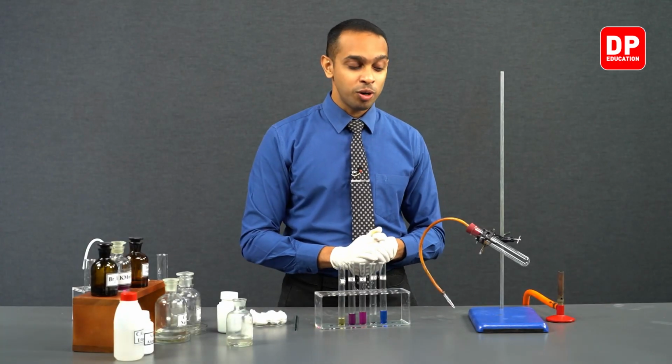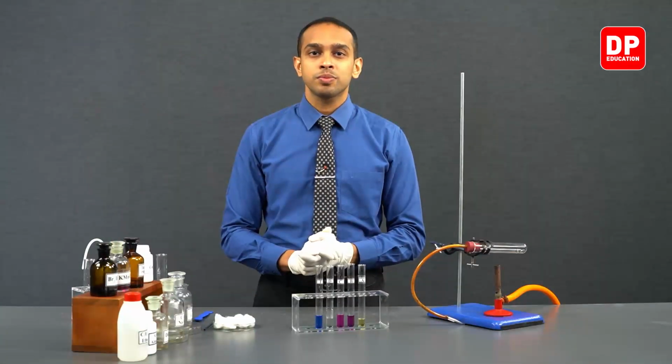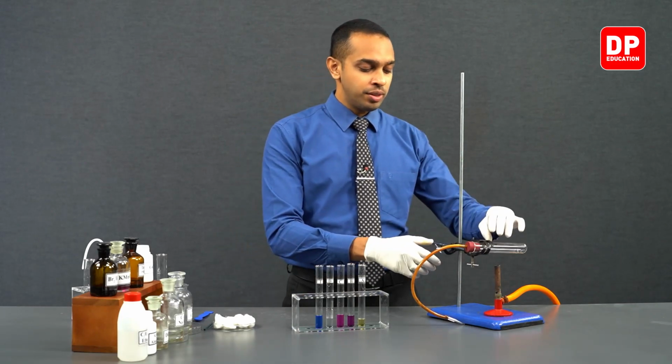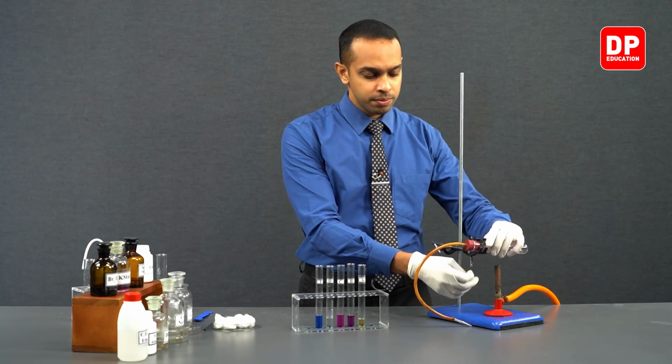Now, we are going to be moving on to producing our ethene gas. So students, to produce the ethene gas, we will be needing a boiling tube.